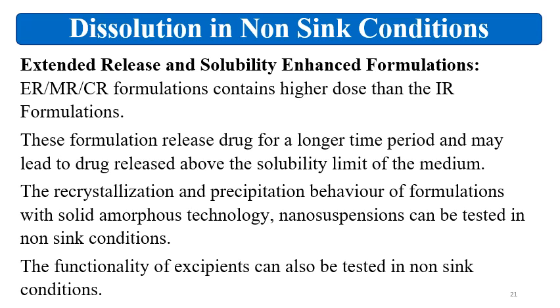See, in the extended release, modified release, controlled release, prolonged release and other formulations in which the dose is higher, for those formulations it is very difficult to have the sink condition. This formulation releases the drug for a longer time, and that's why may lead to the drug released above the solubility limit of the media.